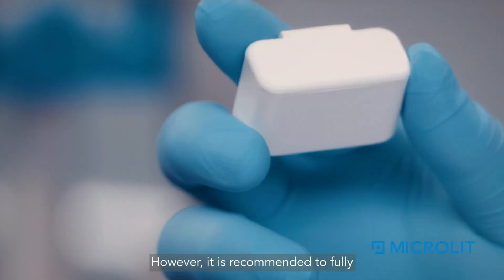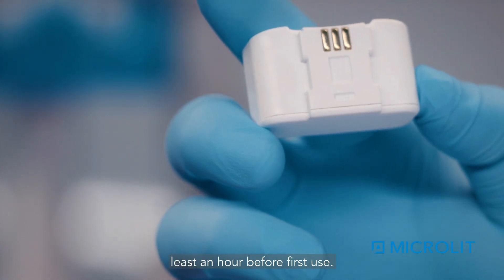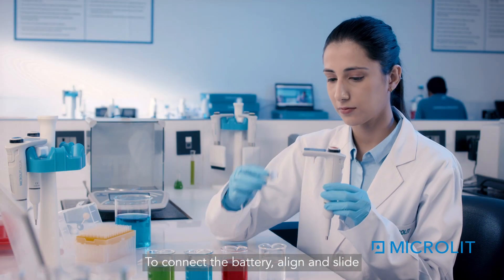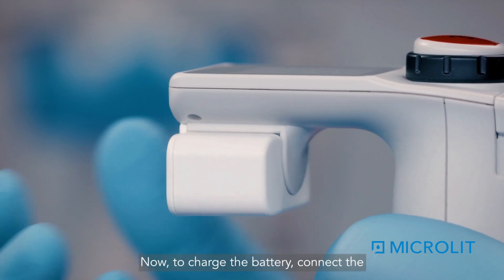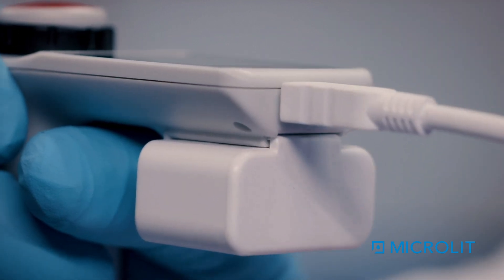It is recommended to fully charge the battery for at least an hour before first use. To connect the battery, align and slide it to the back of the pipette. To charge the battery, connect the charger to the USB port at the back.